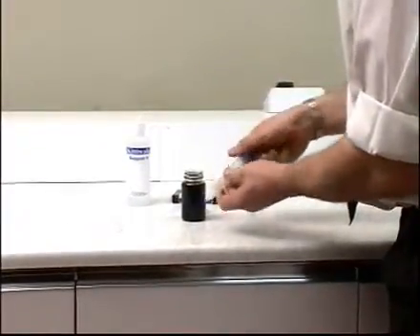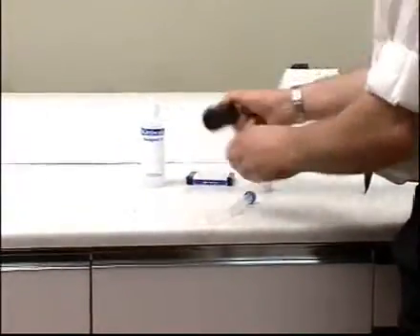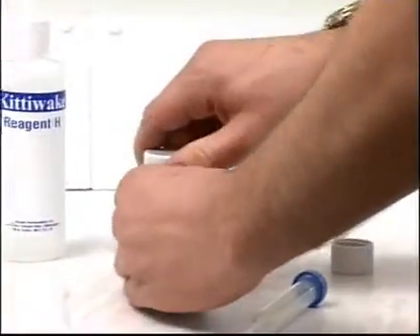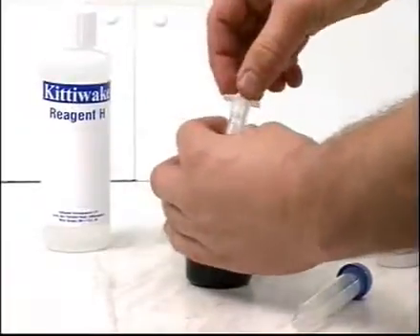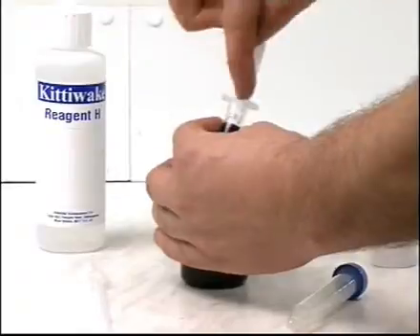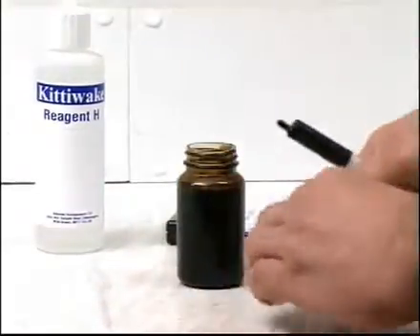Shake the oil sample, then take five milliliters of it with the syringe provided and add it to the test tube.